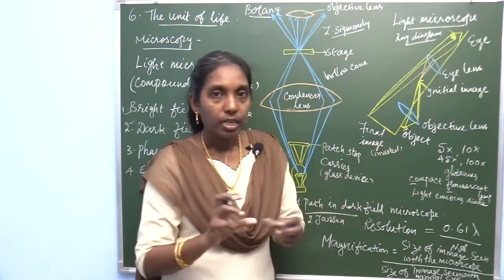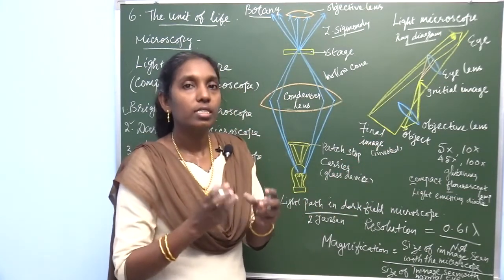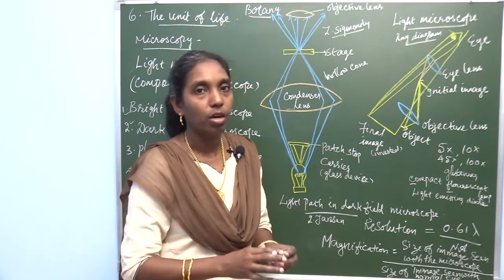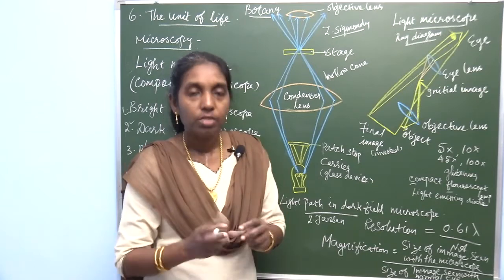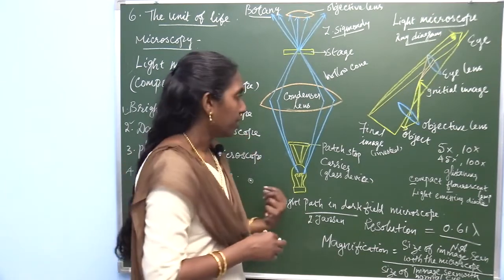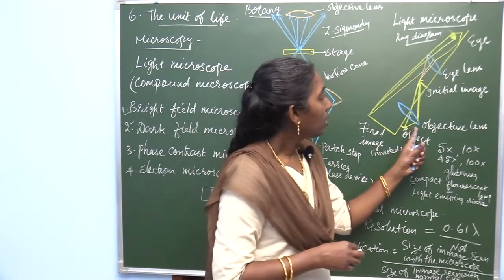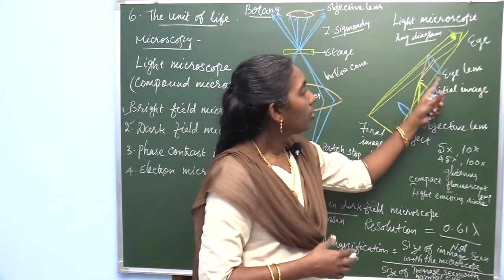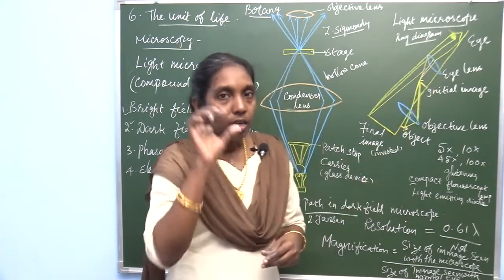At first the condenser lens focuses the source of light, so direct light can be focused directly on the object. That's why first we adjust the lens which focuses on the object. This lens makes the image and it falls to the eye lens, near the eye.